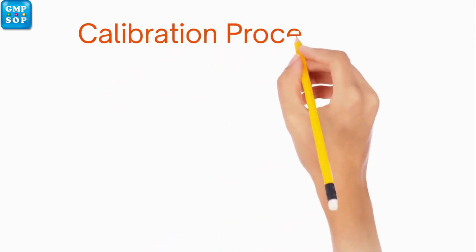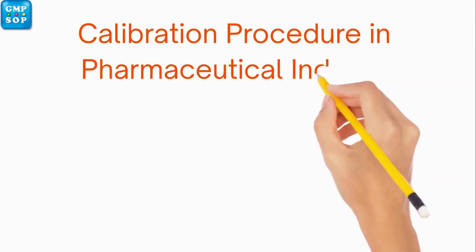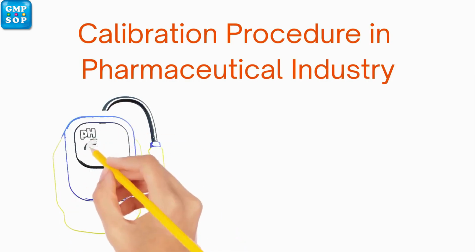Today, we will talk about the instrument calibration procedure, a key requirement in the pharmaceutical manufacturing industry.